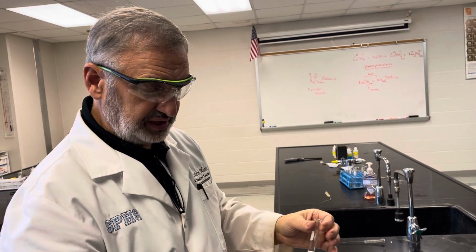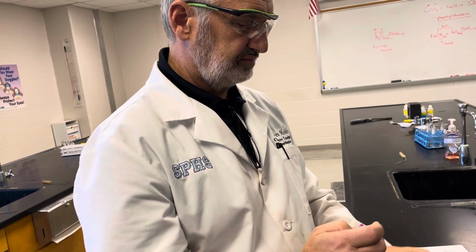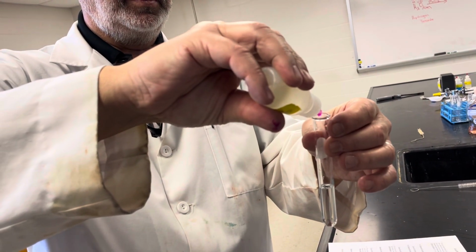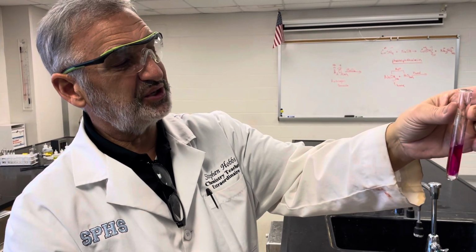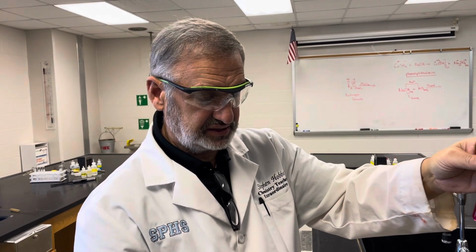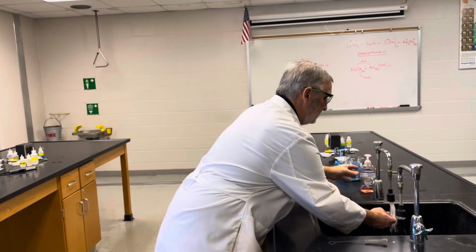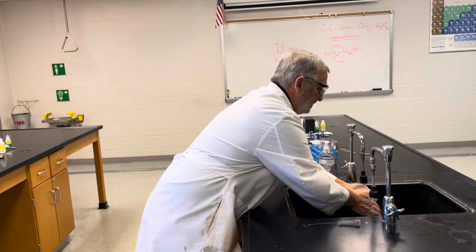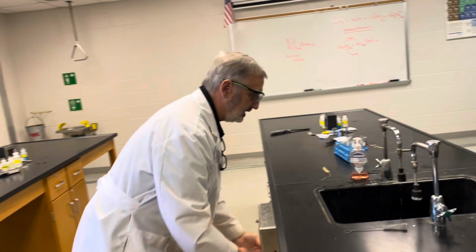So just to play around and have fun, I could put just a little bit more. Drop-wise, ooh, and I'm getting magenta everywhere. And now I'm at 1 drop. So the reality is I'm very, very close to that neutral point, to where H pluses and OH minuses equal one another. All right, so I'm going to wash my hands and try to get some of this stuff off. Always a good safety thing. We have to work on our squirt bottles.